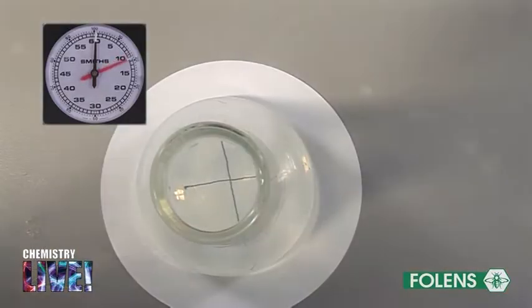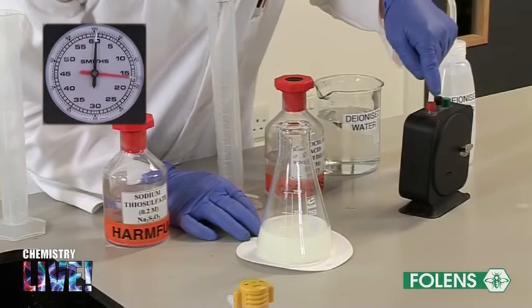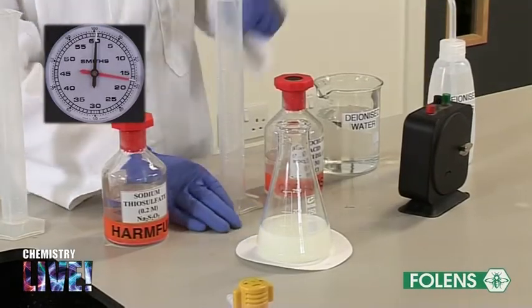Look at the cross through the solution and when the yellow precipitate of sulfur reaches such a stage that the cross is no longer visible, stop the stop clock.